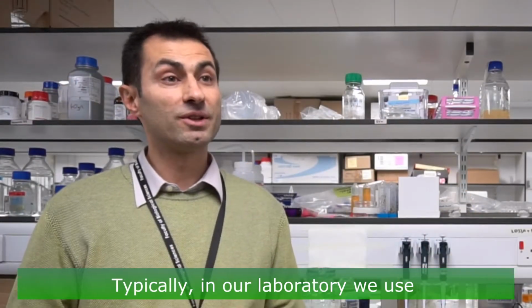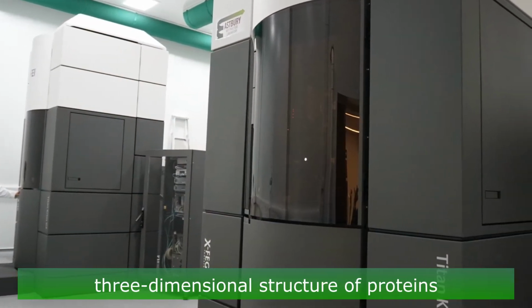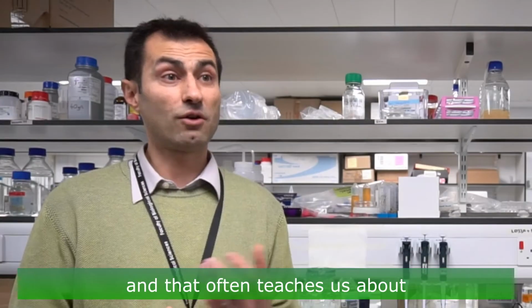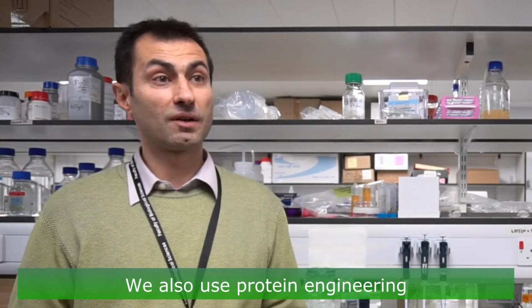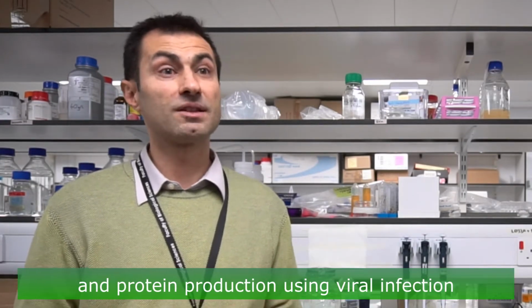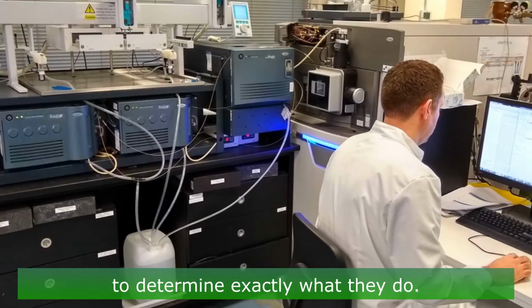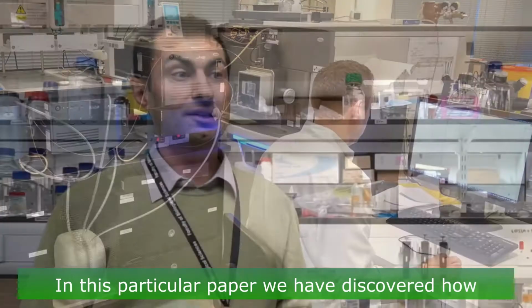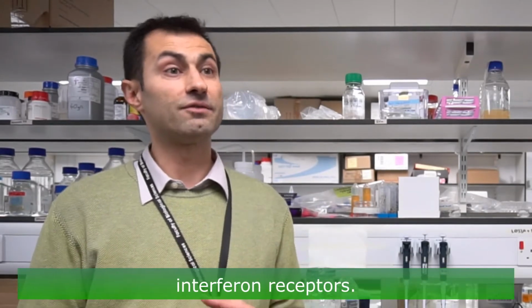Typically in our laboratory we use cryo-electron microscopy to identify the three-dimensional structure of proteins. And that often teaches us about how these proteins function. We also use protein engineering and protein production using viral infection and insect cells. We then characterize them using biophysical and biochemical methods to determine exactly what they do. In this particular paper, we have discovered how BRISC-SHMT2 regulates the turnover of interferon receptors.